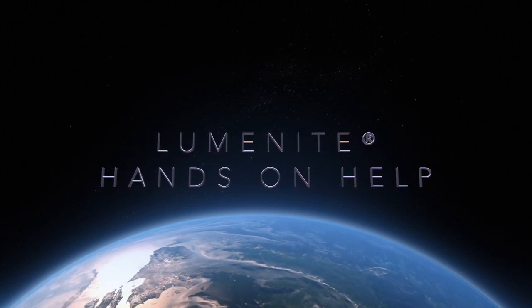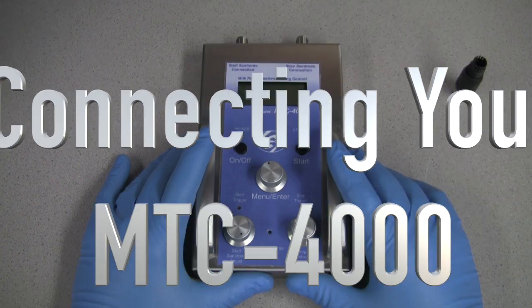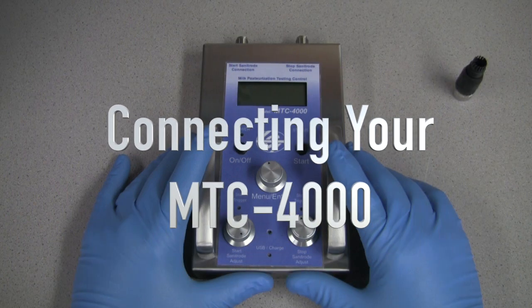Today we'll be showing you how to properly connect your MTC4000 milk pasteurization test control to the 2 and a half inch milk tester jack.